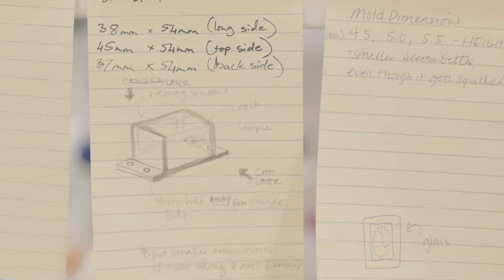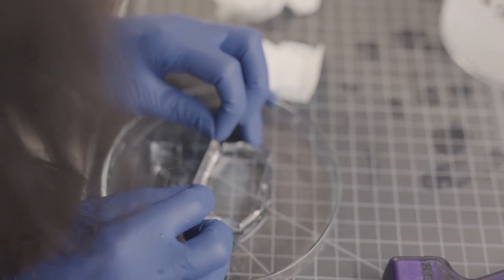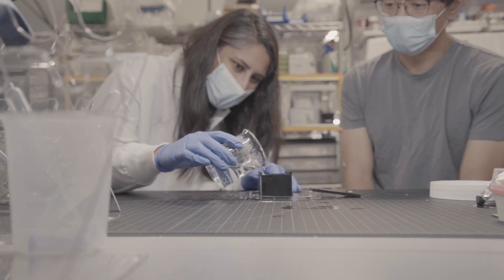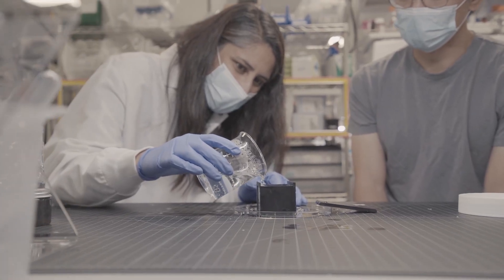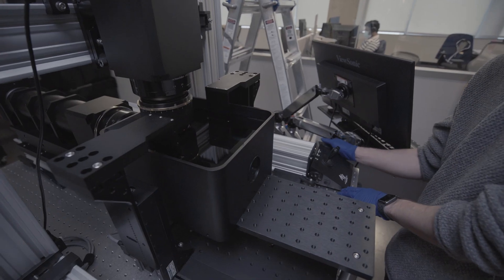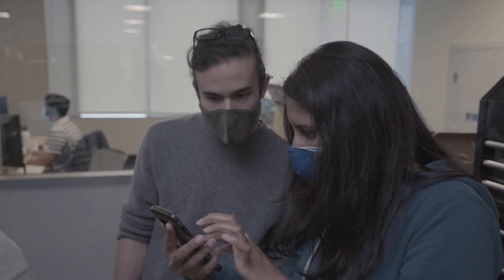I believe the number of mapped neurons from groups around the world is less than 10,000 and that's been pursued over many years. So what we would hope to try and do is over the next three, four, say five years potentially get up to 100,000 and that's an extremely ambitious goal but that's where we're setting our sights.